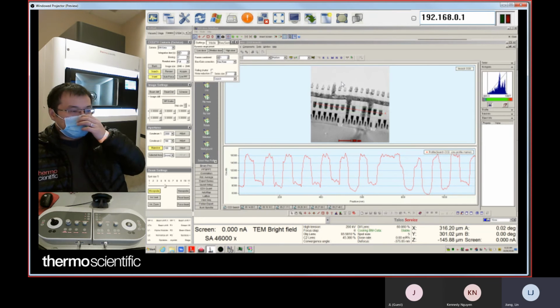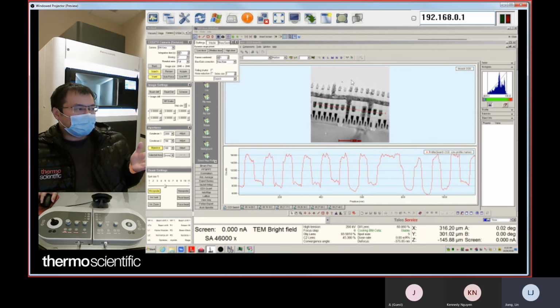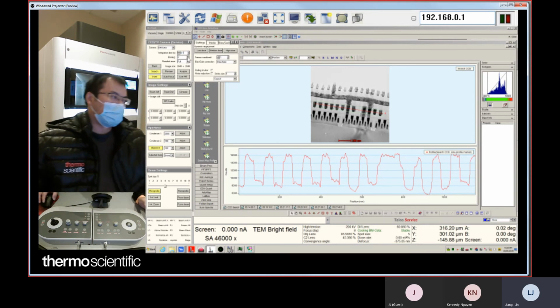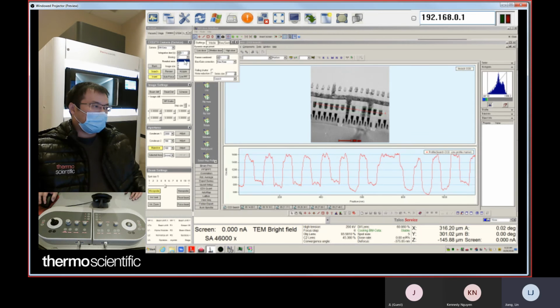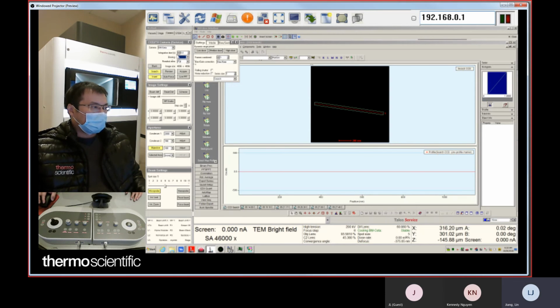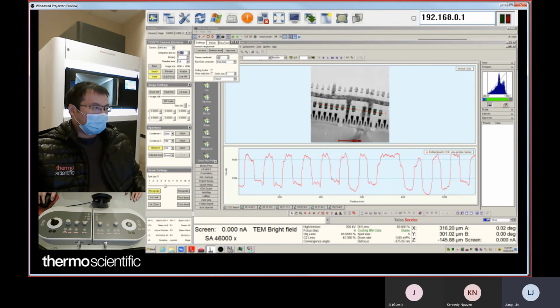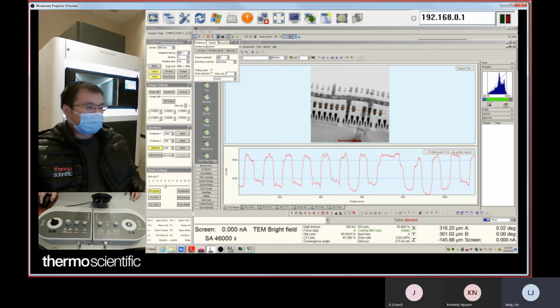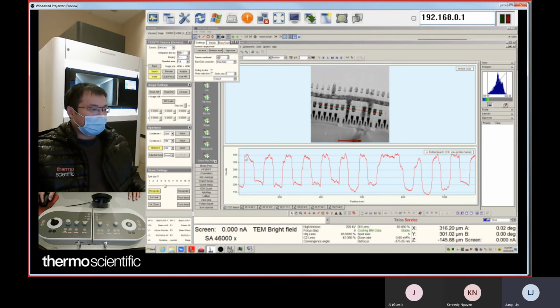So a couple of ways, as I mentioned. First, you take an image, starting from a very low exposure time, like I go 0.1, and I use binning 1, maybe 0.1, binning 1, and then take a look. I get a very low count of 400. I do binning 1, I have no frame combining.